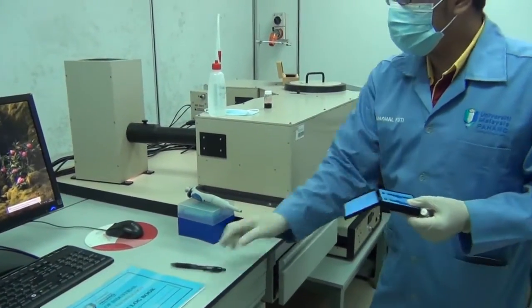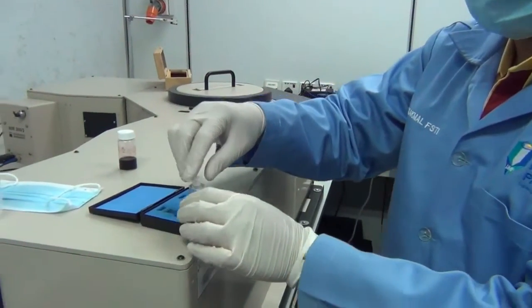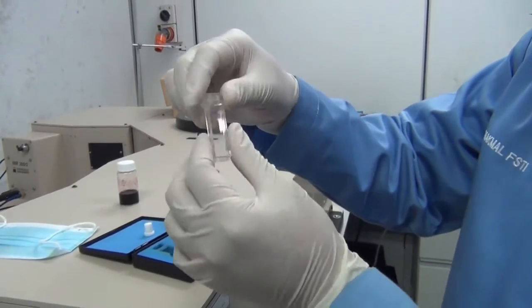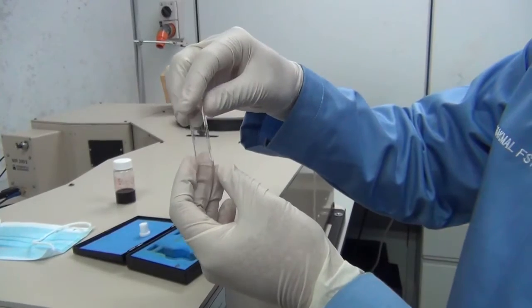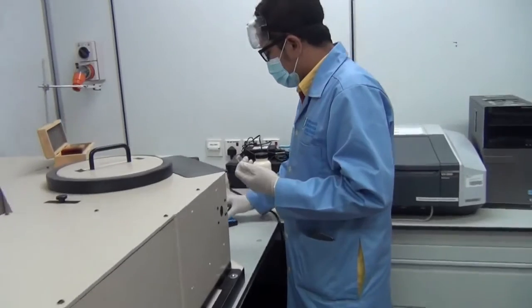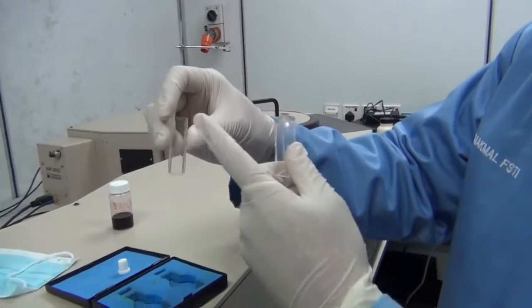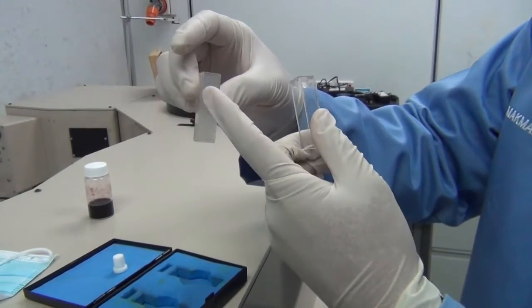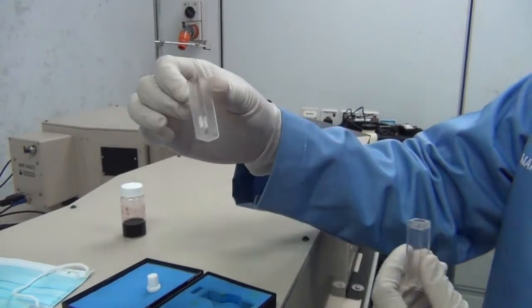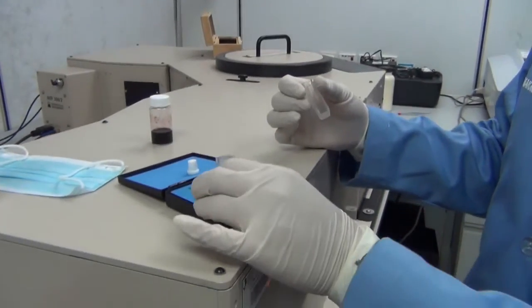While the machine is warming up, we could fill in the cuvette with our sample. See the cuvette, all the sides are transparent. This is the cuvette for PL, very different from the cuvette for the ultraviolet-visible spectrometer. This is the cuvette for UV-vis. It has two transparent sides and two opaque sides. This is for UV-vis. This is for PL. All sides are transparent, so we need to use this cuvette for our sample.